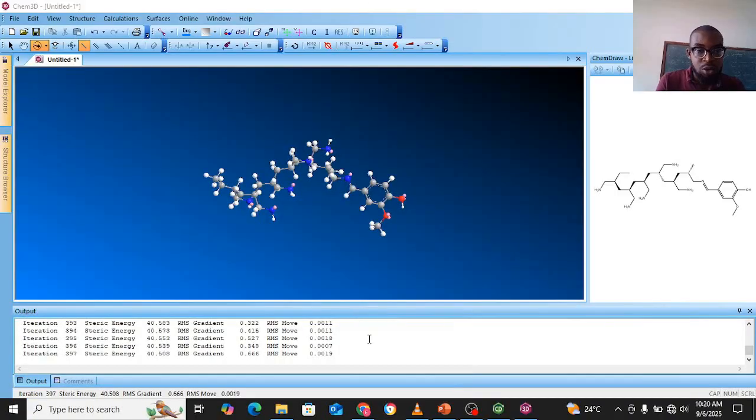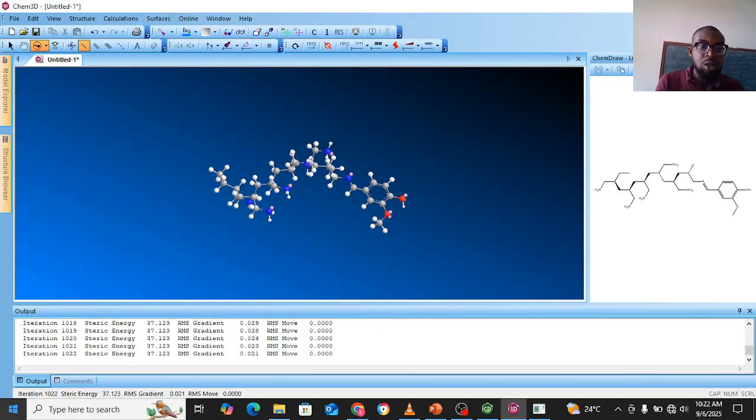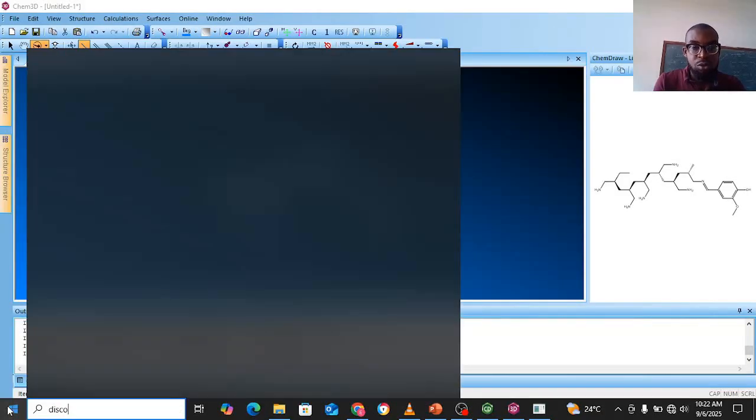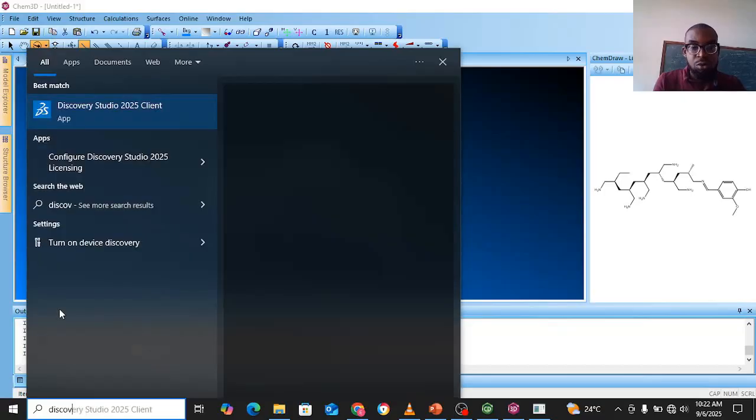It's still yet to complete. While it's still optimizing, let's prepare our protein. We'll be using Discovery Studio, so open Discovery Studio.